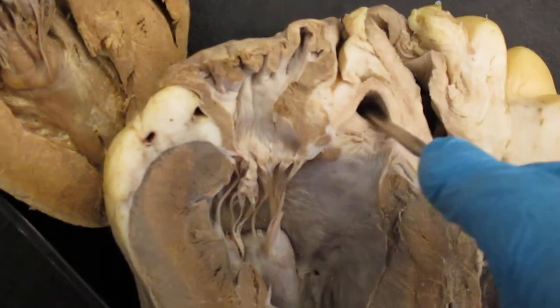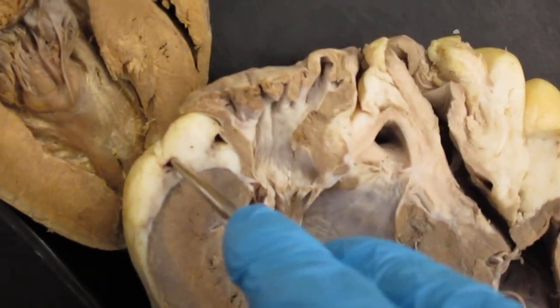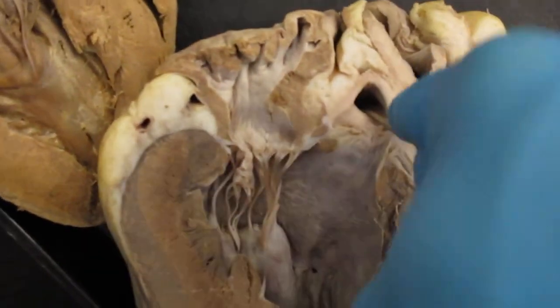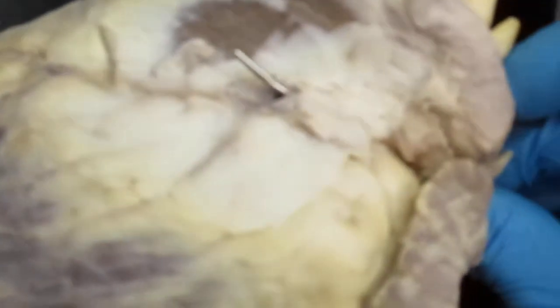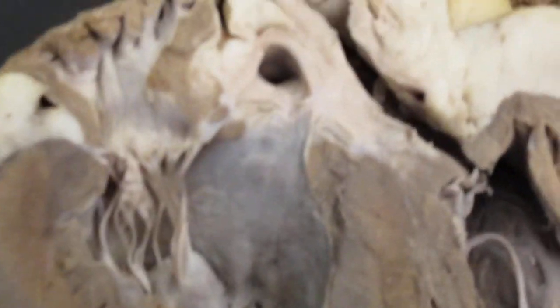These holes here are your coronary arteries or their branches. If you put the probe in this hole here, you can see it coming out right there, going down your anterior interventricular sulcus. That's the anterior interventricular branch of your left coronary artery.